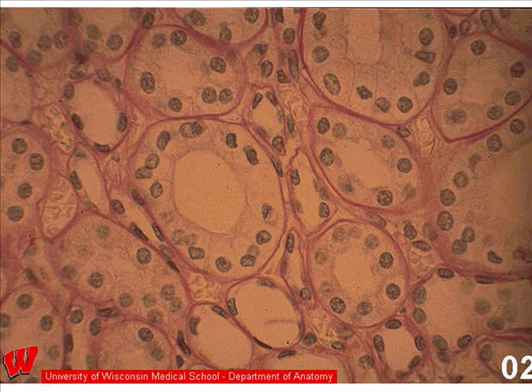There are two types of structures that we can see here. Most of what you see are the tubules that contain the urinary filtrate, which cannot be identified. It's a simple liquid. Also here you can see blood vessels. So the difference here is that the lumen of the blood vessels are filled with blood cells, which you can see by looking in the center of the lumen.